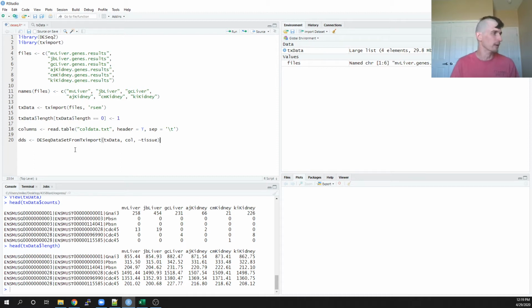But anyways, I digress. So DESeq from tximport, as I said, we can just pull out those columns, round down or round up so they're whole numbers, and do a DESeqDataSetFromMatrix. Just read in a matrix table.